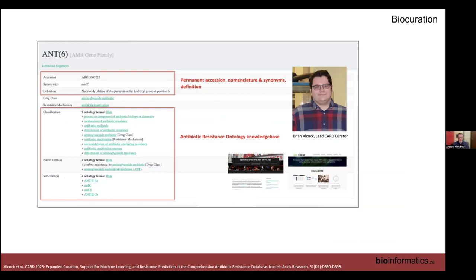A CARD gene page — for example the ANT(6) aminoglycoside resistance gene family — contains a permanent ARO accession number like ARO:3000225 that will never change, synonym tracking, a written definition, and the Antibiotic Resistance Ontology (ARO) knowledge base. This large ontology describes mechanisms, drugs, gene families, and adjuvants that suppress resistance. CARD collaborates with the Genomic Epidemiology Ontology, IRIDA, and the Canadian federal government to ensure the ARO meets data sharing and harmonization standards. The ARO is never commercialized — ontologies must remain open for data harmonization across the field.